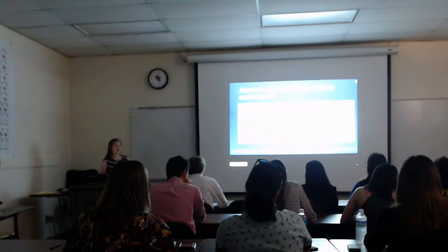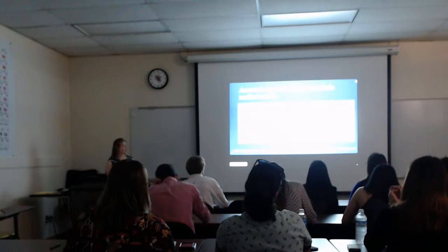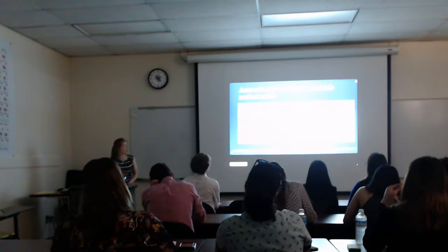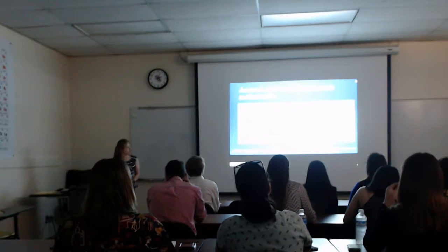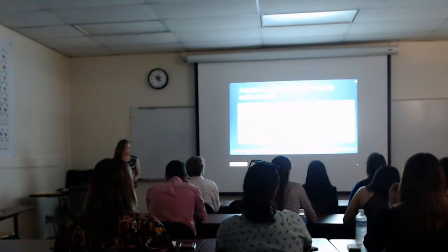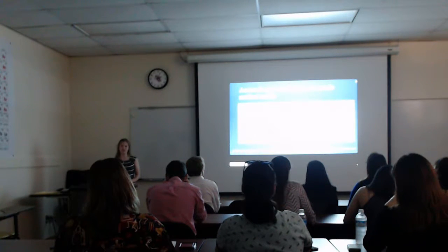So we looked at the standard deviation next to see if maybe the method was at least more precise. It very clearly was, because based on what we are looking at, we actually have relatively low standard deviations. The highest one that we have on here is about a 6, and 6 out of 120 isn't all that bad.